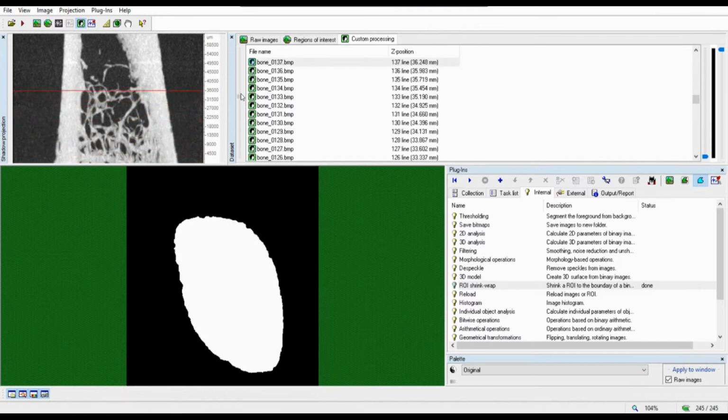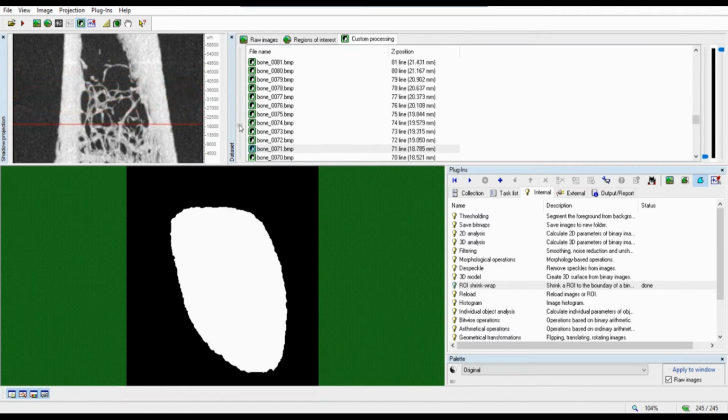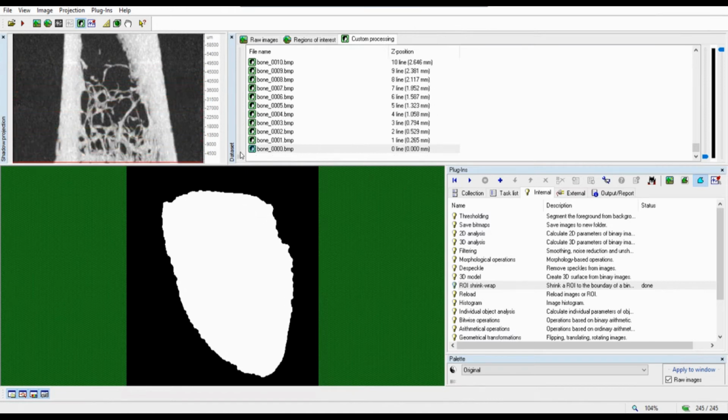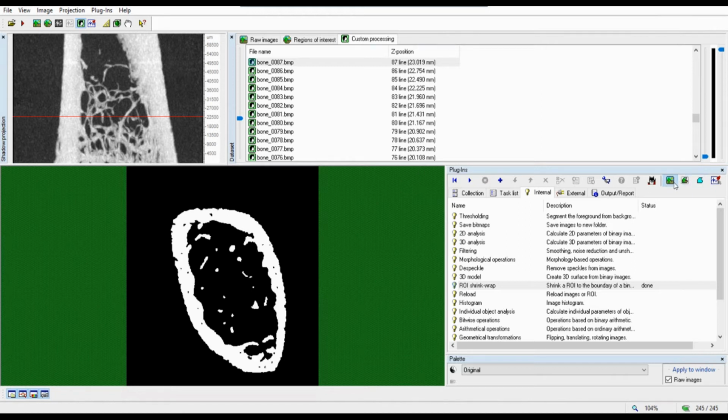It's very important that you swipe all the way through the sample very carefully to check for any unwanted happenings. None of the images should have any opening or any empty space inside. So this is a good one. I'm going to add it to the plugin, to the task list. So next step, we can have a look here.